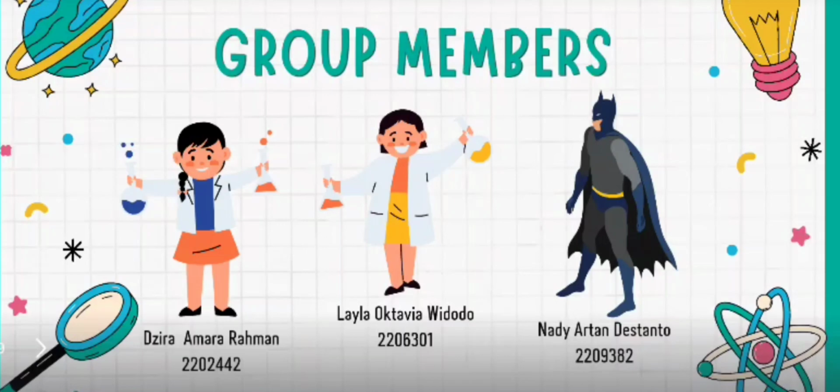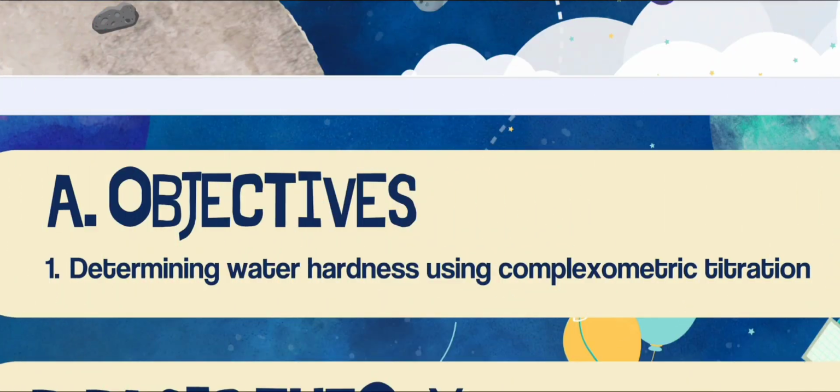Okay, let's get started. So, the objective is determining water hardness using complexometric titration.